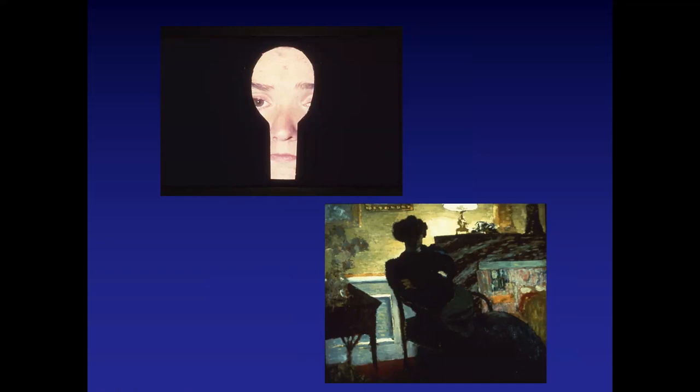Fine needle aspiration biopsy is practically like a keyhole. You're looking at the keyhole and trying to see the entire room. What it means is that you need to be a good surgical pathologist and know what the room should look like in order to be able to look through the hole and see what you are looking at, and what that small number of tumor cells represent. So it's a very important consideration to have in mind when you're looking at a fine needle aspiration biopsy procedure.